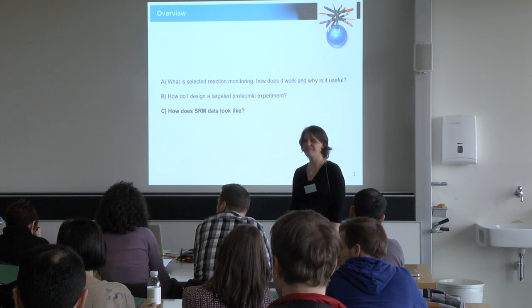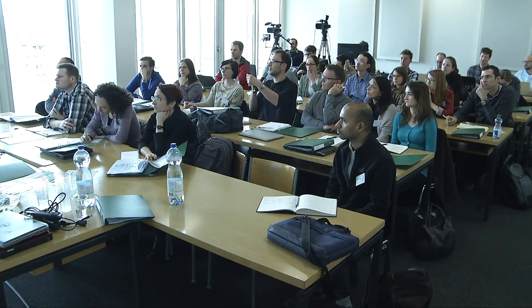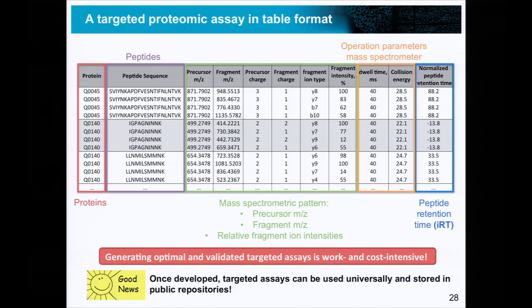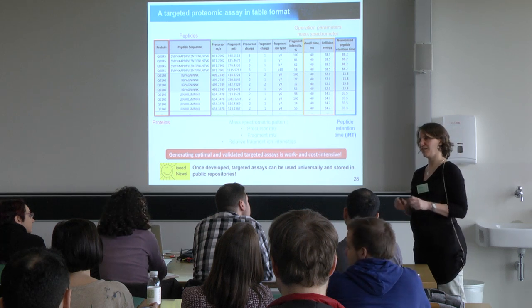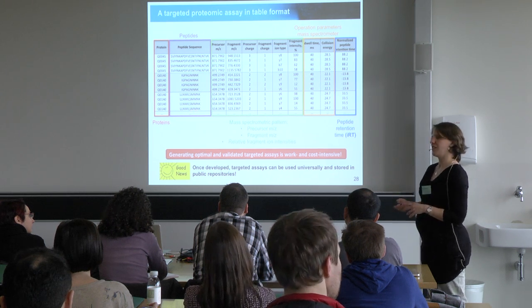And a question, two slides before this one. So the last peptide, maybe this is not a specific experiment. The last peptide that you have selected has at least 3 methionines, and so here we are talking about the non-oxidized form of any of those 3 methionines. Exactly. So usually you should have the oxidized form here. If you target the oxidized form, it will be another peptide, indicating whether this amino acid is oxidized or not. So this was the non-oxidized version of it.